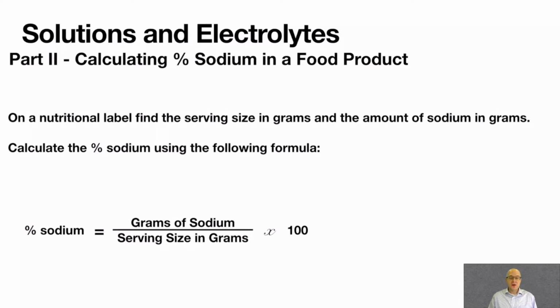Now, reading the nutritional label, you need to pull off the grams of sodium in a serving size, as well as the grams or the mass of a serving size. You need both of those to calculate the percent of sodium in your serving size, in your sample.